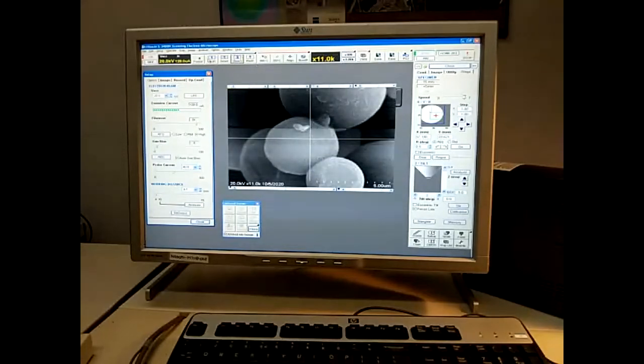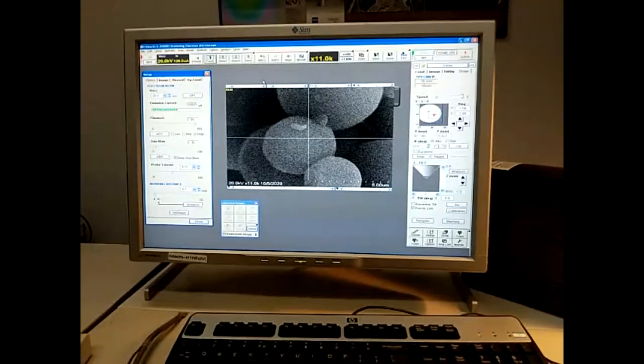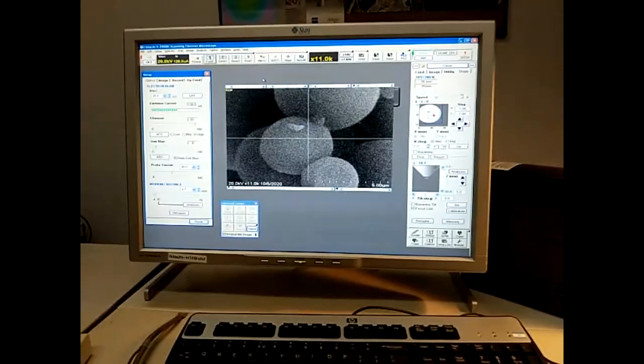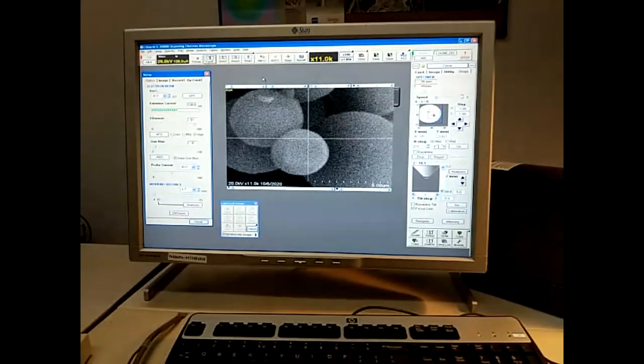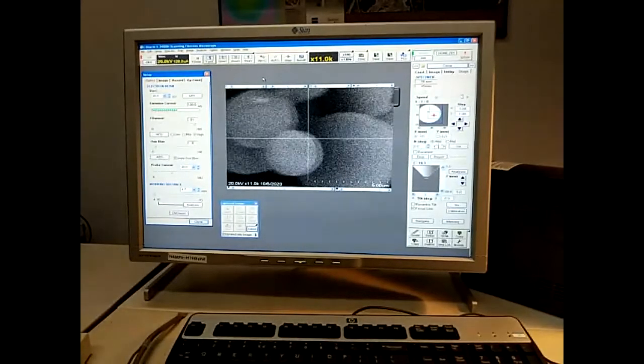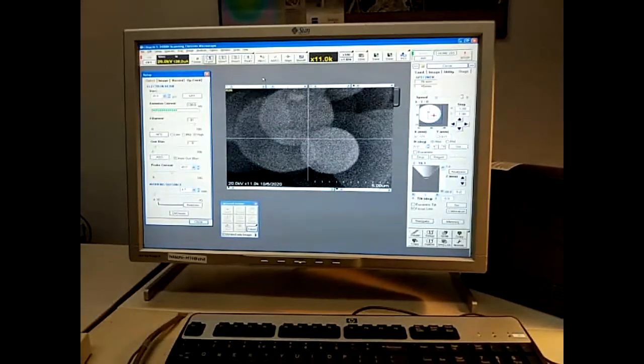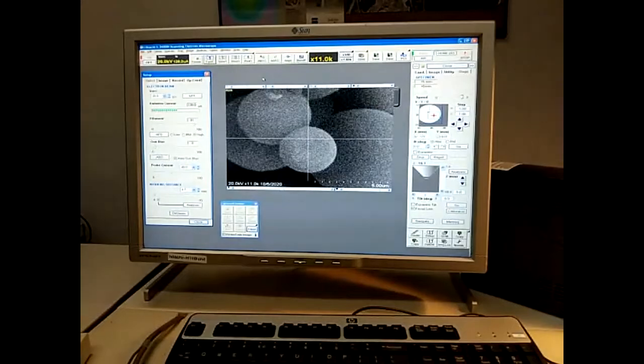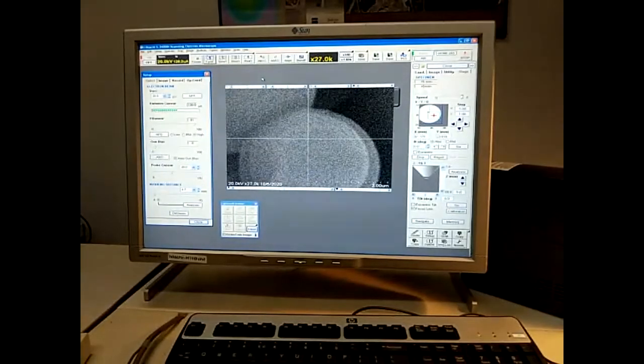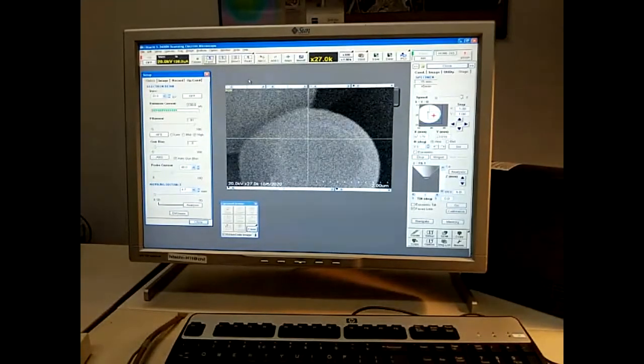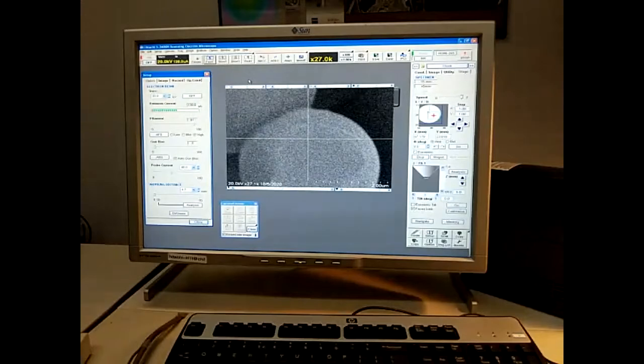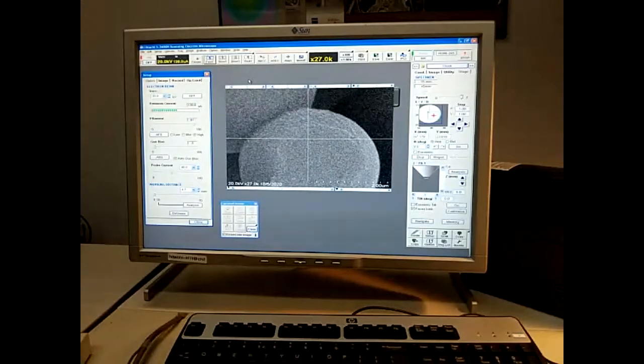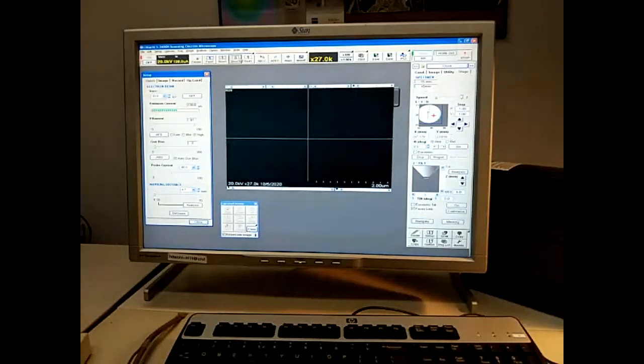Again, back to fast mode. I'll try and zoom in on this fellow here, do a little bit of focus, and back to slow mode.